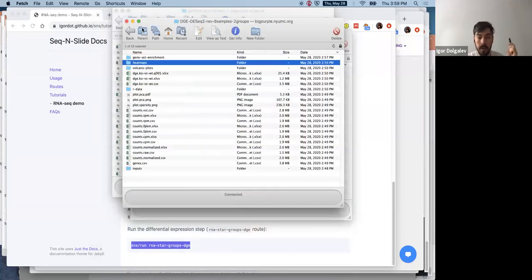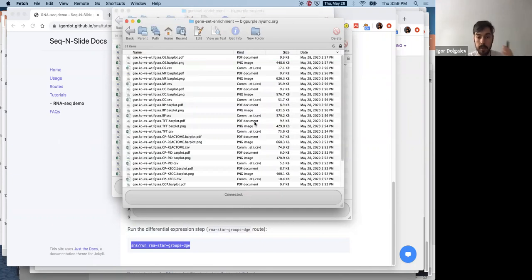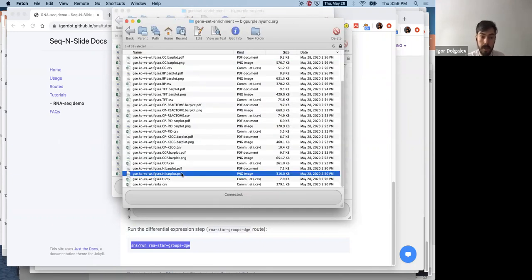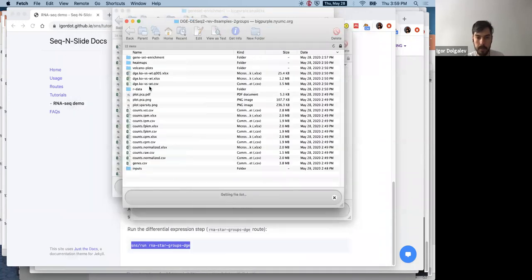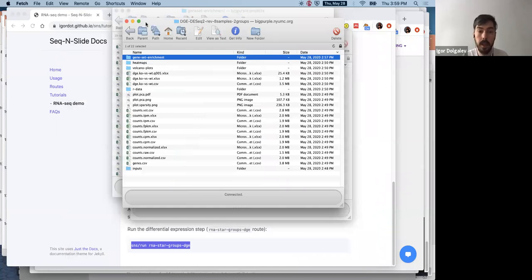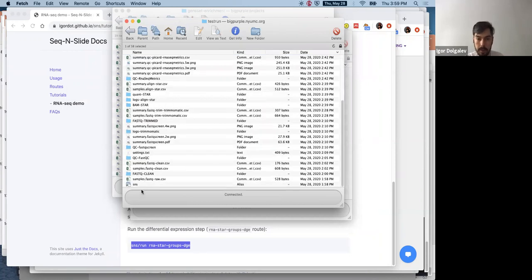And of course, there's gene set enrichment, which shows you if there's enrichment in certain pathways for your differentially expressed genes. For example, here we see that the interferon signaling is increased in the knockout samples. But there are a few different ways to do the pathways. And of course, you'll go through DSeq in more depth next week.